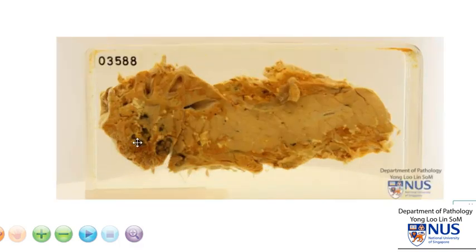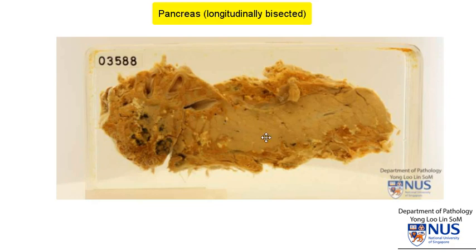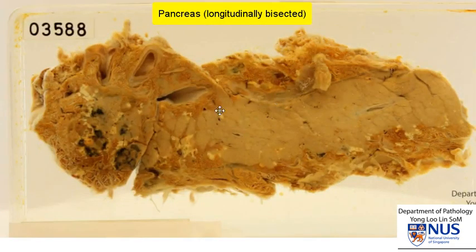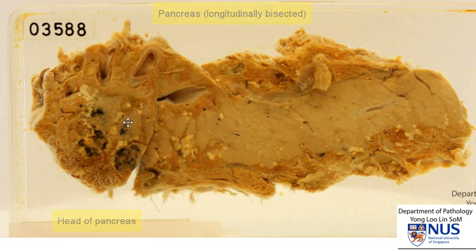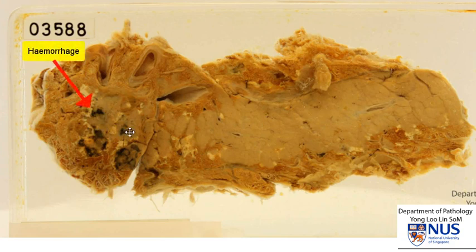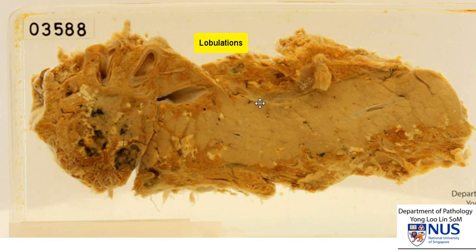Here is an example of a pancreas that has been bisected longitudinally. We are looking at the cut surface, and this is probably the region of the pancreatic head. There are some darkish areas here which are likely to represent hemorrhage. We can still make out the vague lobulations of the pancreatic parenchyma, and this is part of the normal architecture where you have lobules that contain the exocrine elements, and also some endocrine elements within the lobules.